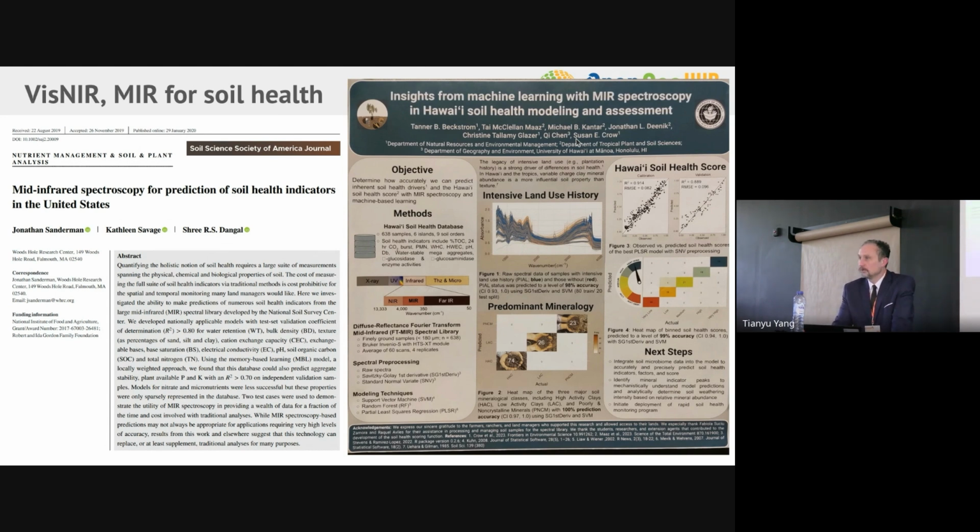And also here you see we do these scanners. They do cost a few €1,000. Let's say this is still low cost for soil spectroscopy, but they don't do miracles. They have a limited accuracy.